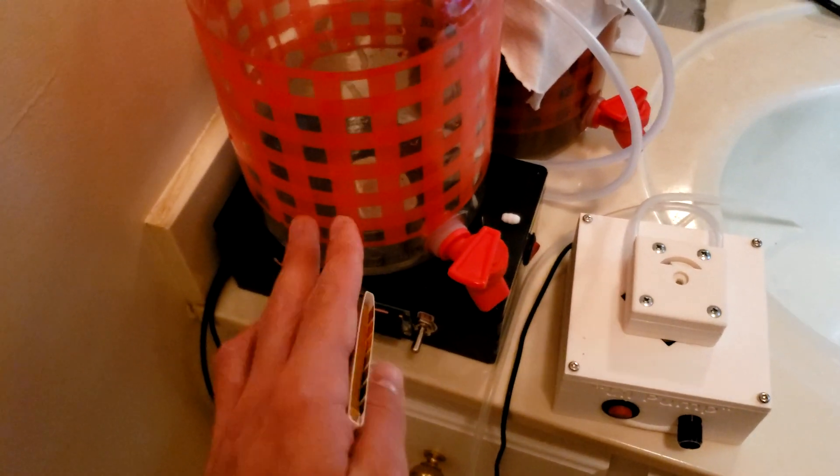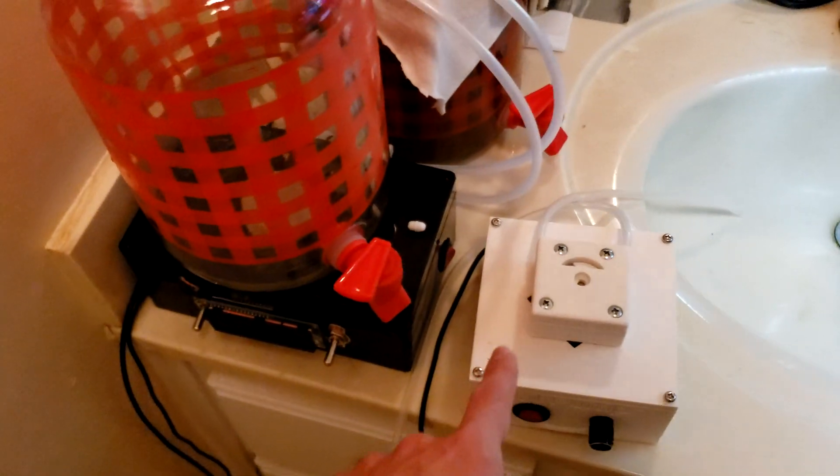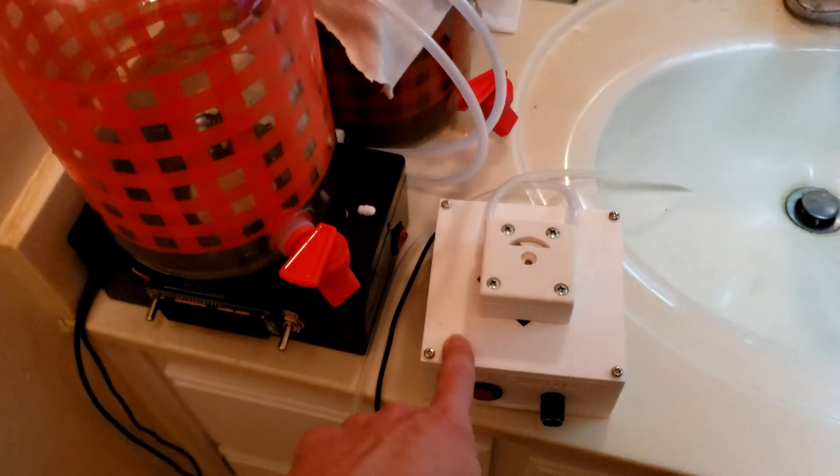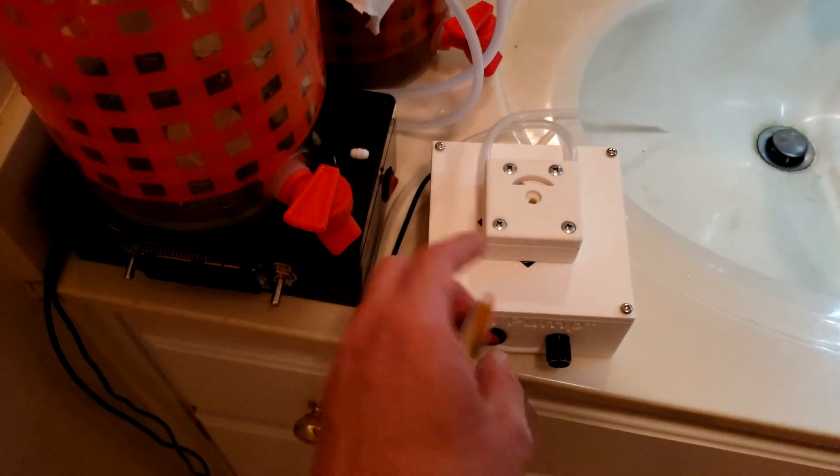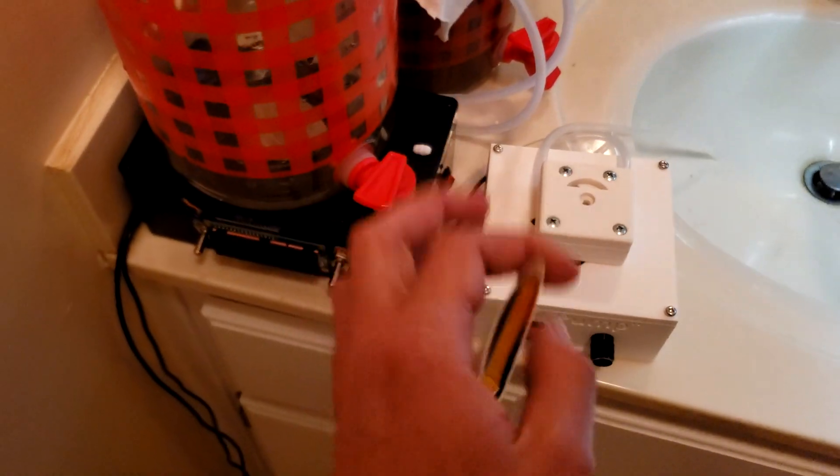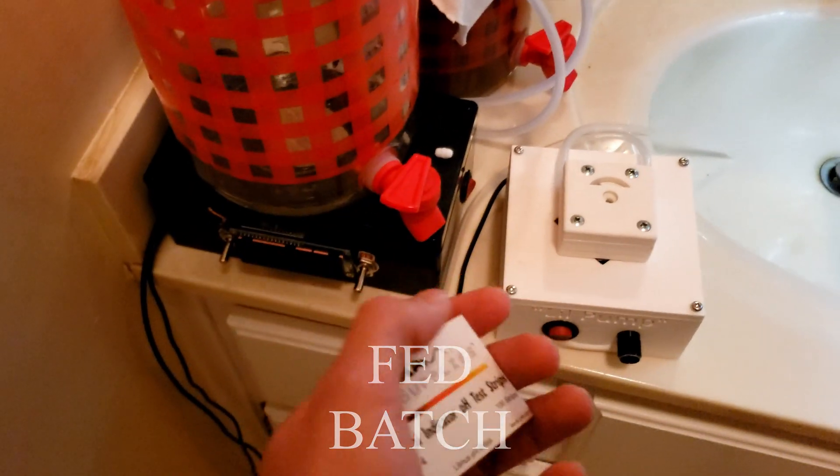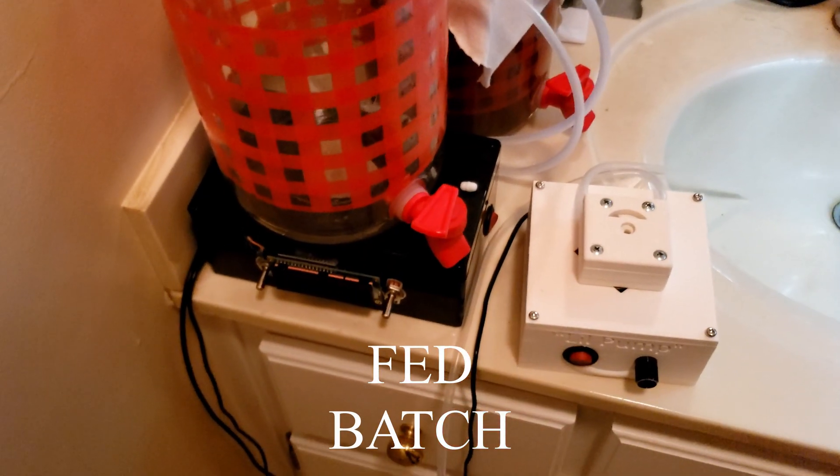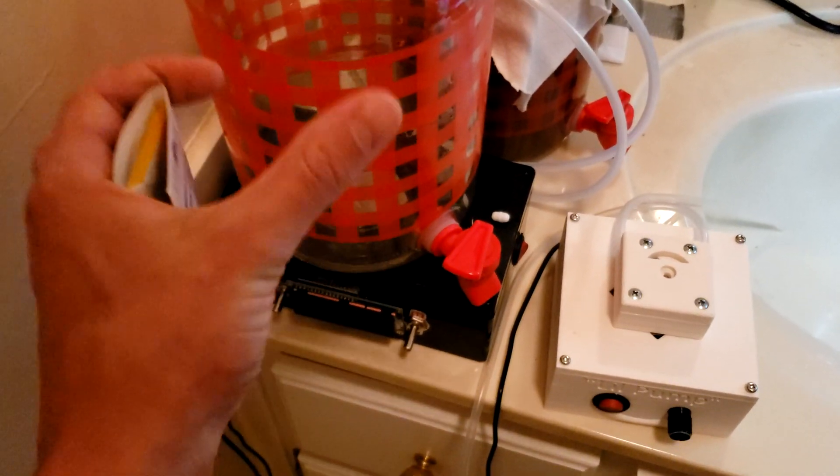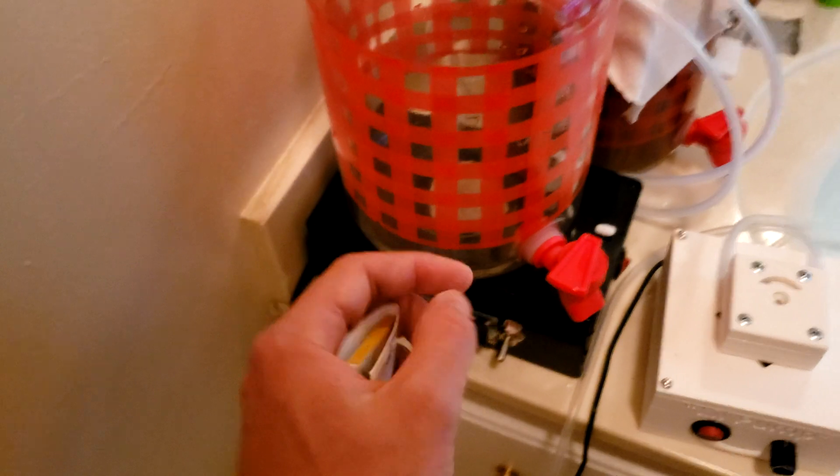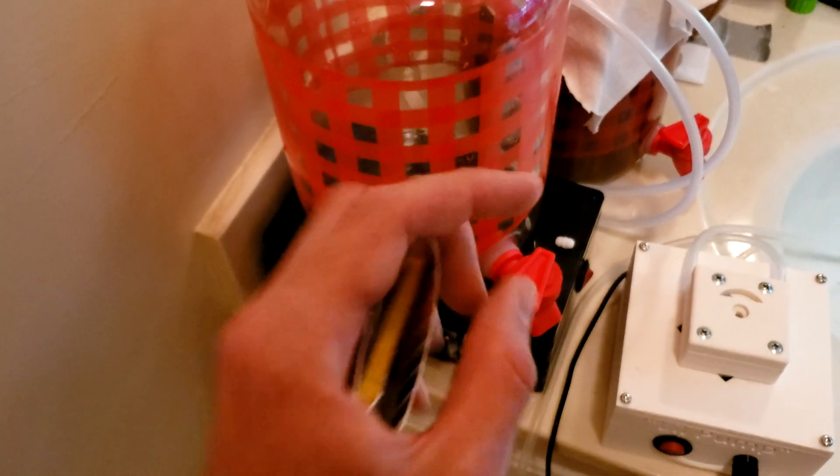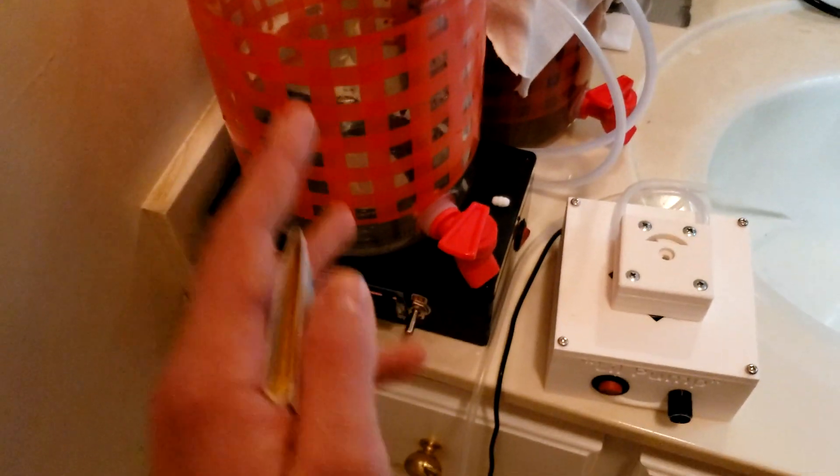And we'll let that go probably for a couple of days just to make sure that this is all working properly. And then after the day or two, we're going to start adding our fresh tea. So I'll follow the same recipe that I normally use when I make kombucha. And so essentially what this is going to be is a fed batch process. So this is what it's called in industry, fed batch process. And all this really means is that we have a batch process going on, but we're feeding in more substrate so that we can maintain the growth of our organism at its optimal growth rate.